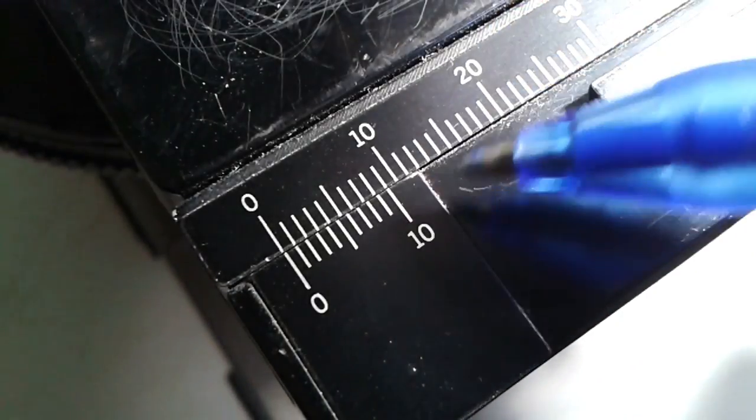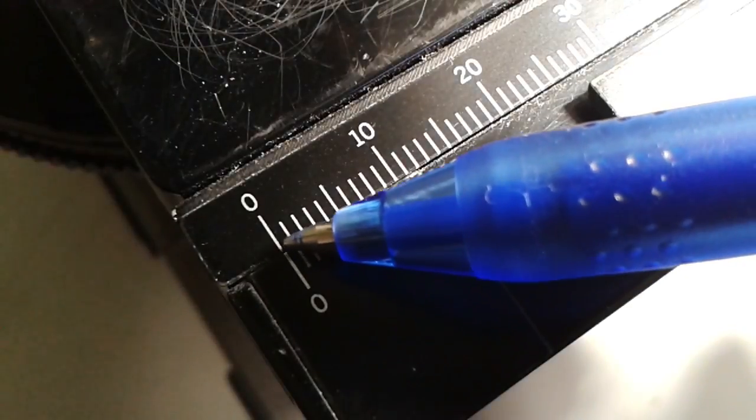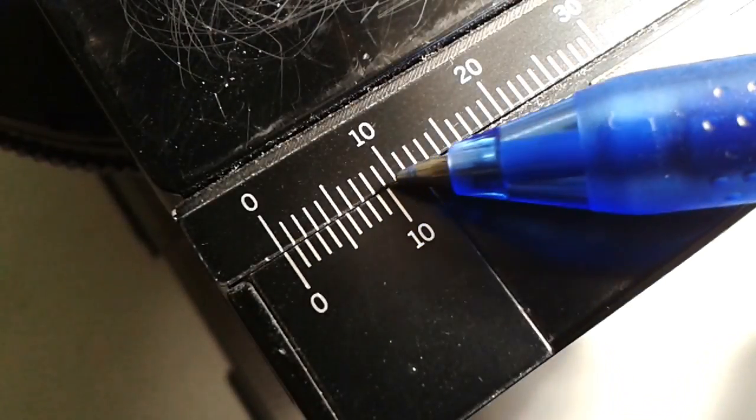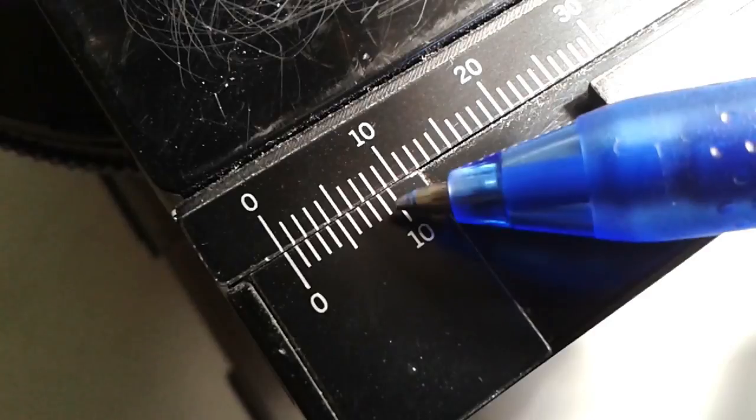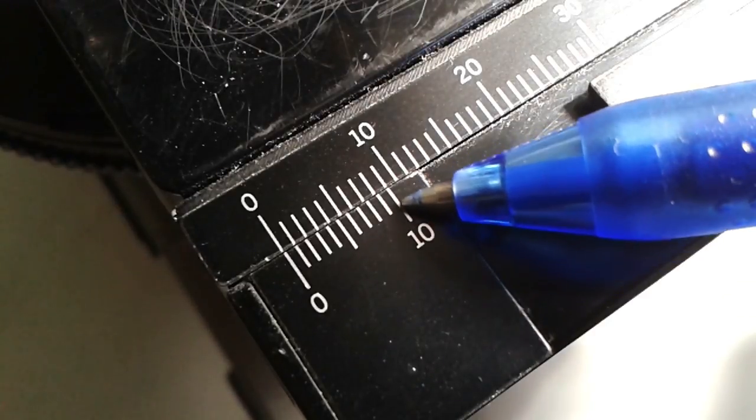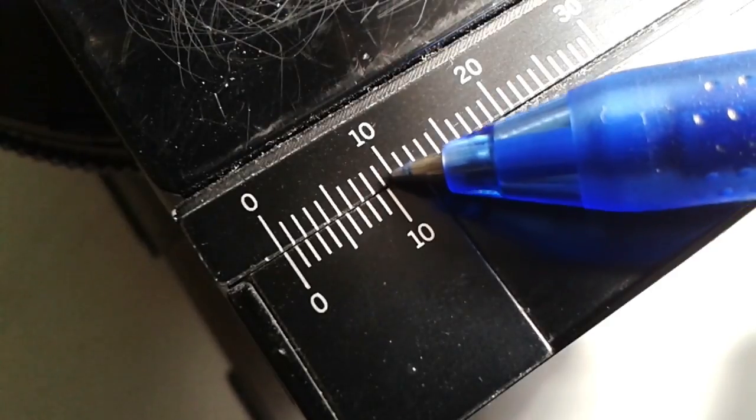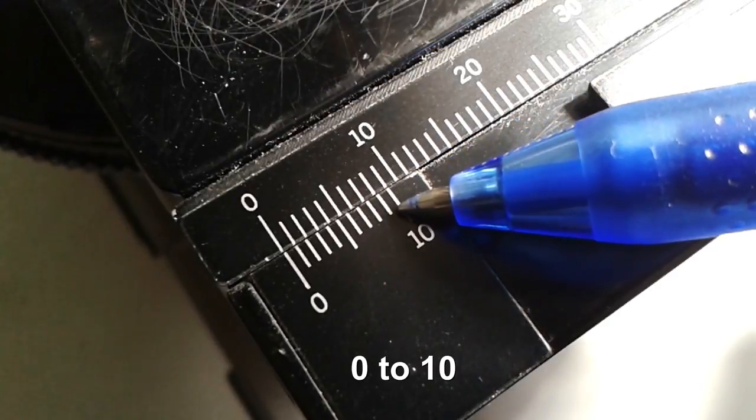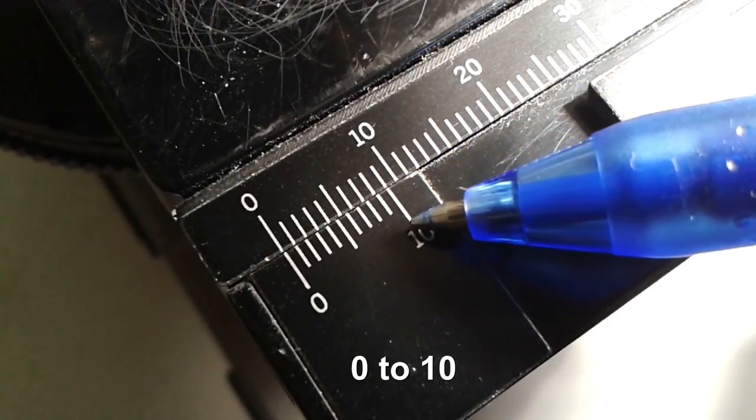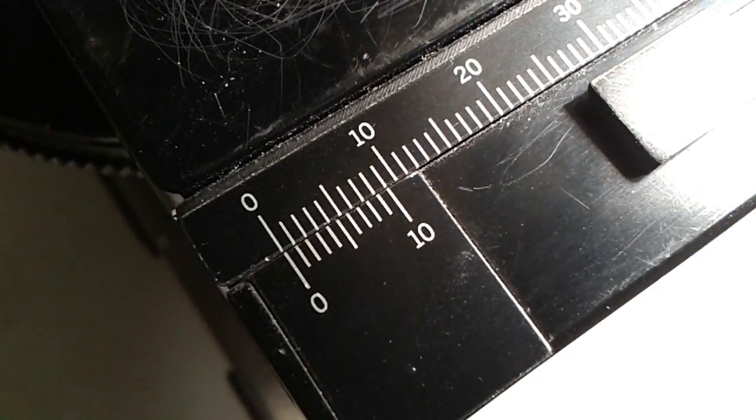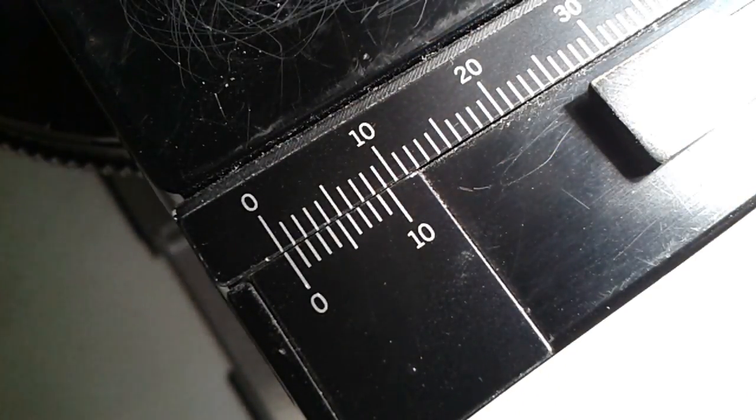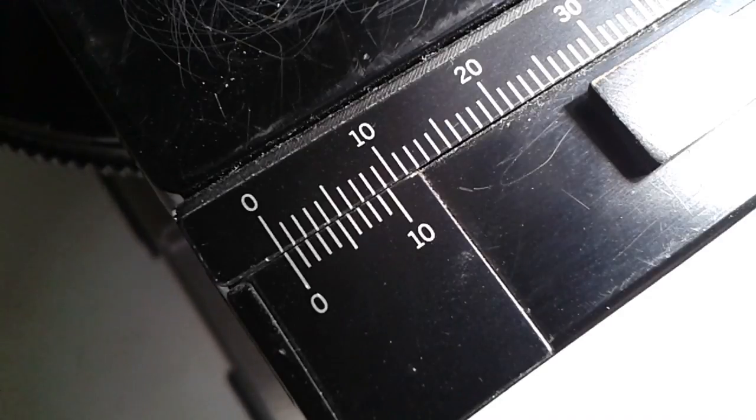And here is a close-up and what you can see now is that the large scale, these are millimeters, so it goes from 10, 20, 30 all the way up to 50, 60, 70. And then there is a smaller scale and the smaller scale while it also goes from 1 to 10, the lines are a little bit closer together. And so you can see that on the smaller scale, the smaller scale ends there where there is the 9 on the larger scale.